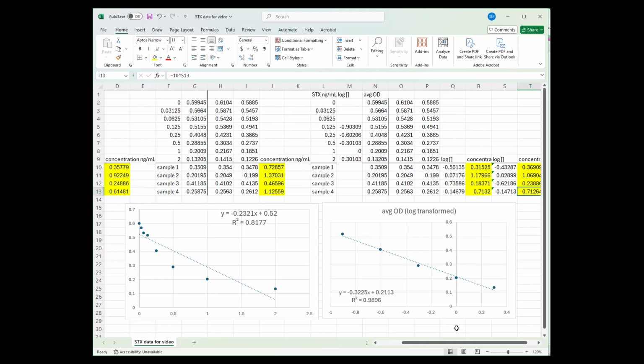If that happens, then you either need to stop your curve sooner with the acid stop so that it becomes linear at those lower concentrations, or use a program like GraphPad that can do a sigmoidal response calculation, a sigmoidal curve calculation rather than linear.